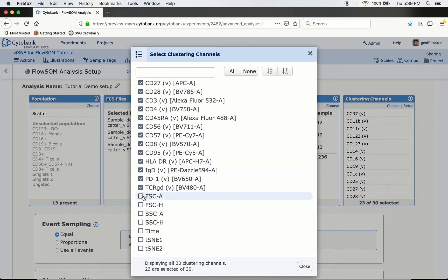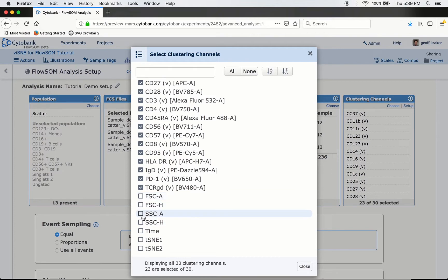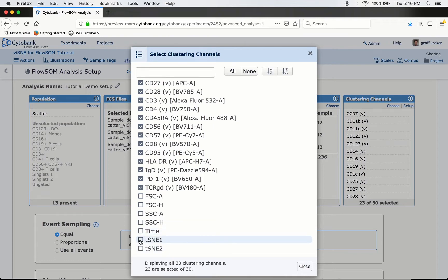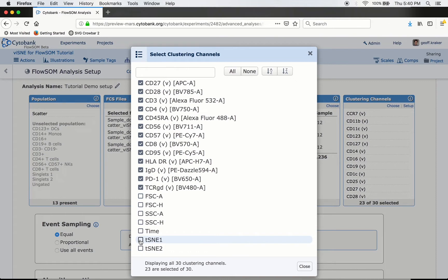Linear-scaled parameters like scatter should not be run at the same time as arcsinh-scaled parameters — they swamp the calculation and you'll only get clustering based on linear markers. Time should also not be included — it's not a cell-intrinsic characteristic and it's linear. tSNE 1 and 2 are the condensed differences of all channels already; we'll just have them along for visualization of the FlowSOM result at the end but won't include them in clustering.